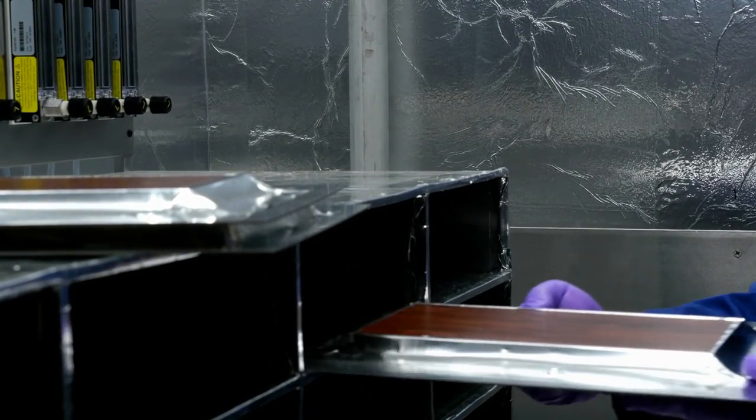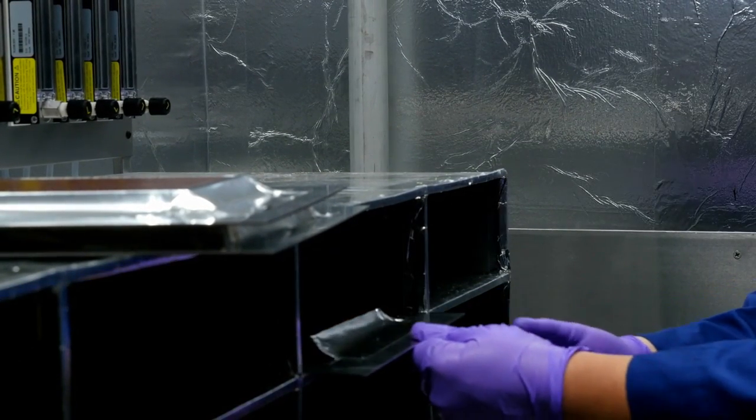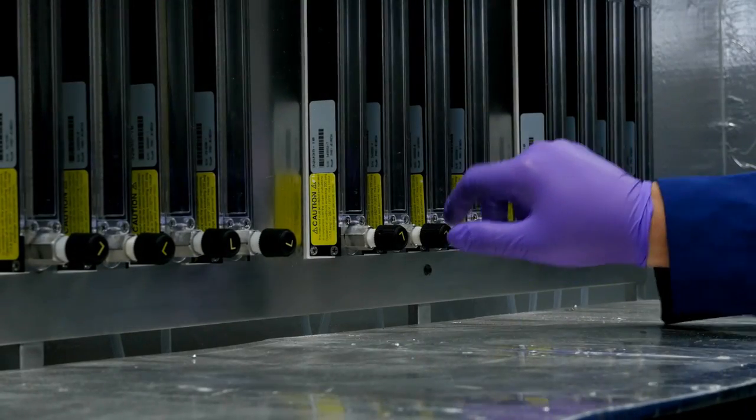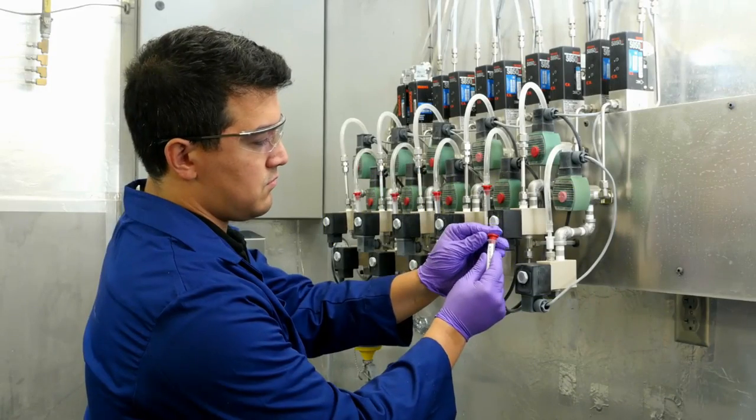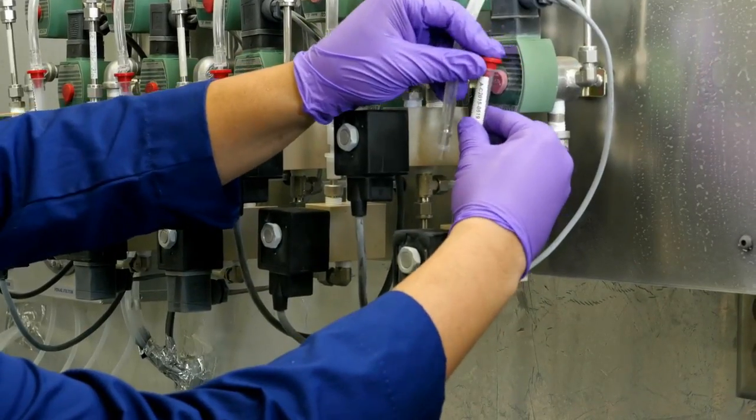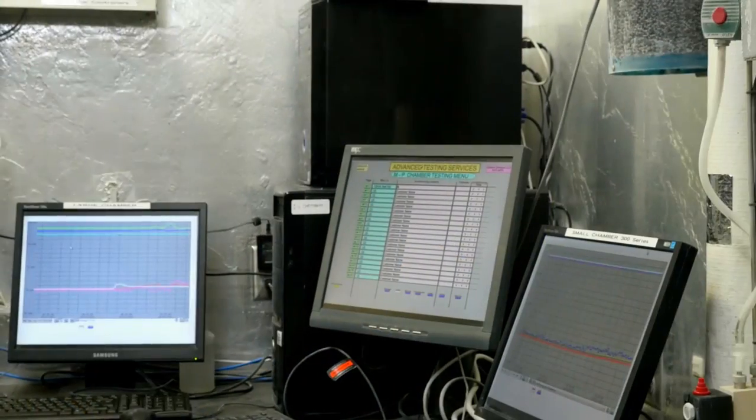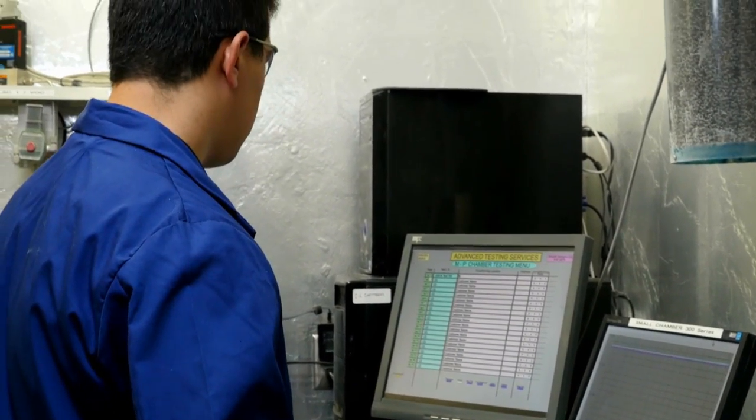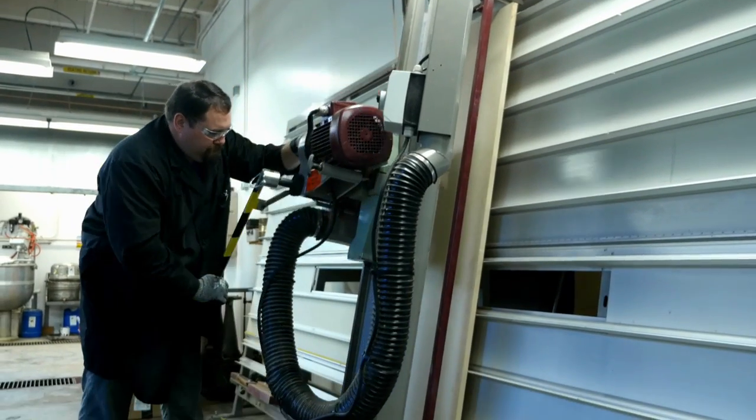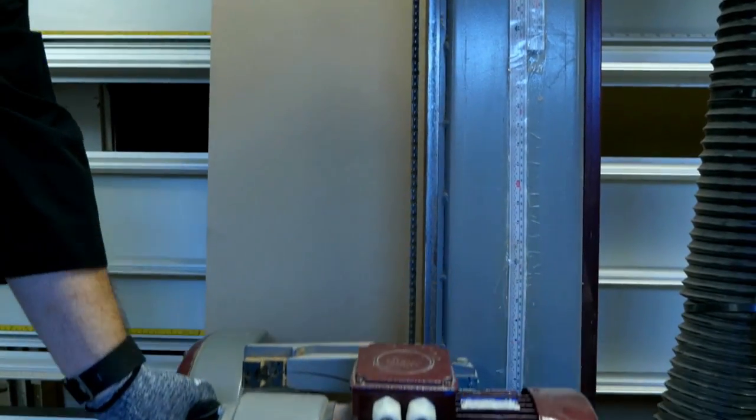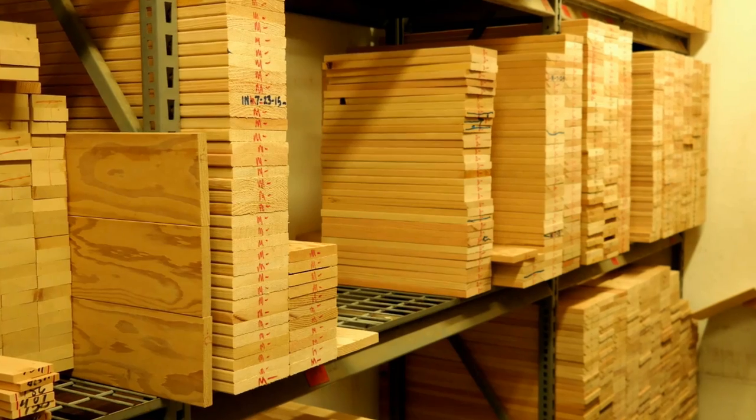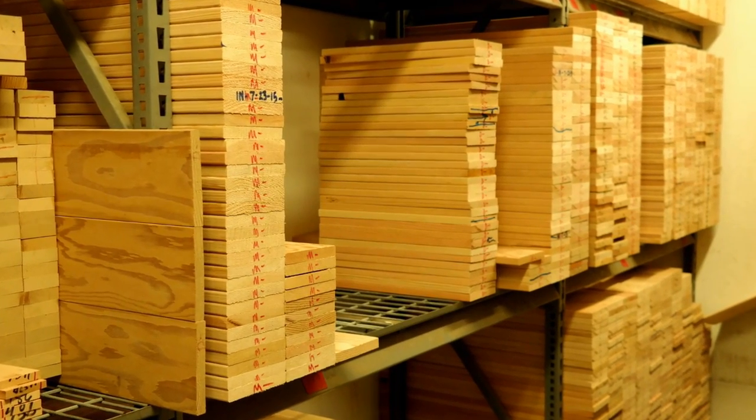The ATS laboratory's accredited procedures have played a crucial role for the engineered wood industry to achieve CARB requirements. The state of California has recognized the lab's high standards and has used Hexion as a resource in developing the CARB standard. A meticulous chain of custody process and standards are followed when Hexion's ATS laboratory handles customer samples to ensure the integrity of all testing.